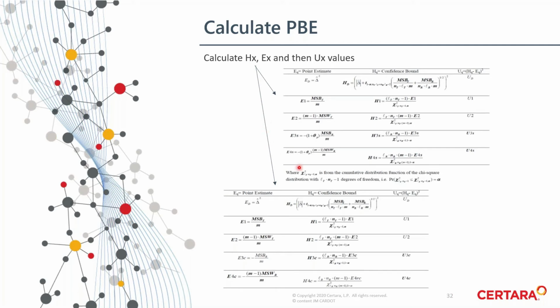That means you are able to calculate both of them. So as it's easier to calculate everything and later on to give the options to know what you are going to use, I take the option to calculate both of them. That means the scaled and unscaled matrix.